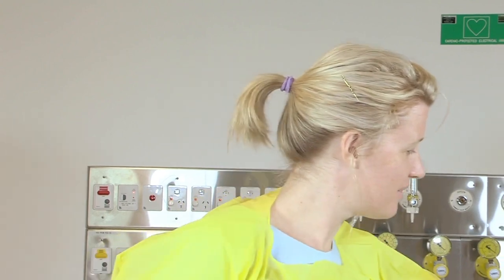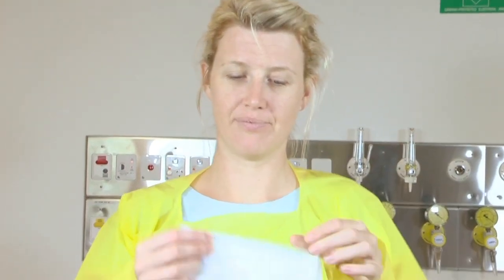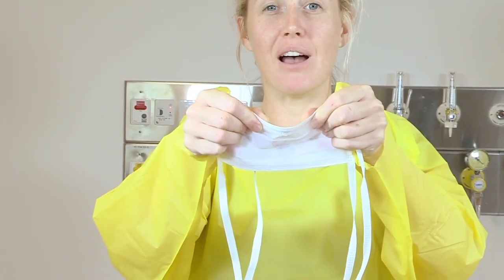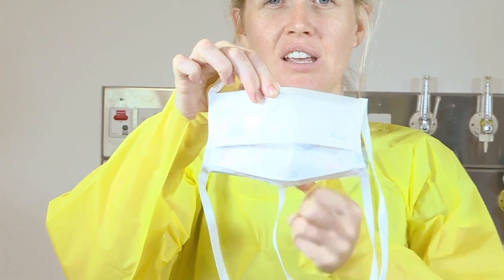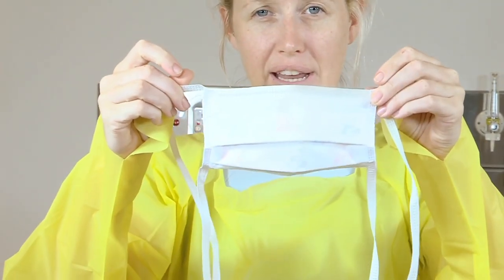The next item we're going to don is our face mask. Today we'll be demonstrating a standard surgical face mask. Retrieving a mask from the box, curve the flexible band to fit the mask over the bridge of your nose. Spread the mask in a downward direction, then secure the ties at the back of the head and the back of the neck.